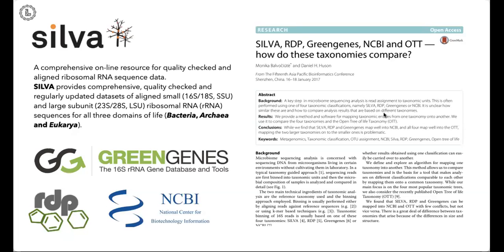The primary database that we will consider is the Silva database, a comprehensive resource of the 16S ribosomal RNA of all bacteria. There are other databases like NCBI RefSeq, or the NCBI database in general, GreenGenes, and RDP, right? But the most preferred database for bacterial classification is Silva, because it is regularly curated and updated, thanks to the participation of various research labs from around the world.